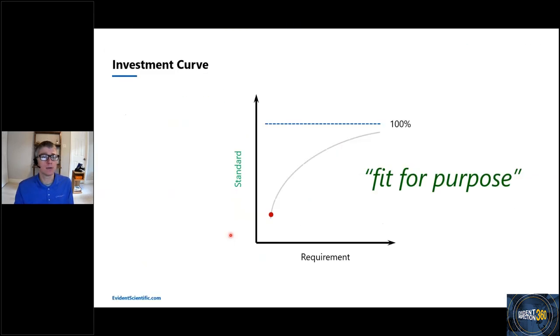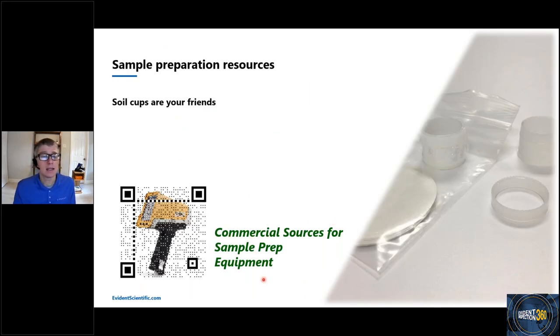But if you have something that's a hard rock mineral, then you're going to want to get some kind of mill. And there are several options. Again, if you scan this QR code, it'll take you to them. You can use something like a masonry drill or a rotary drill, like you might drill rock or brick with, to get some powder samples. Those work pretty well. There are portable mills, portable grinders, even battery operated ones that you can get. And then of course you can get large laboratory benchtop ones, but in the field you probably want something that's battery operated, sort of low tech. And then, of course, the harder the rock, the more professional grade grinder you need to homogenize that sample. So it again depends on your type of project. But I give various options from cheap to extremely expensive in this guide right here.